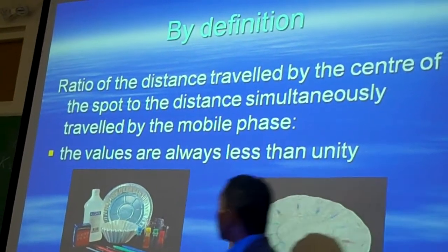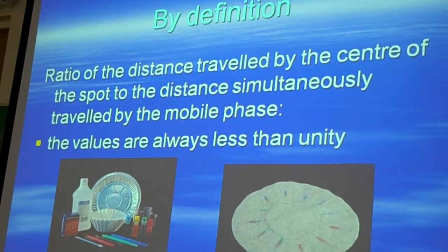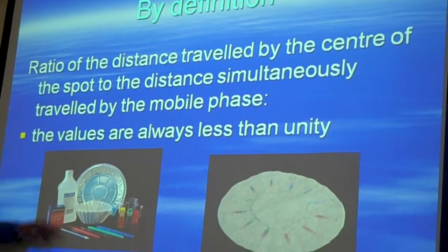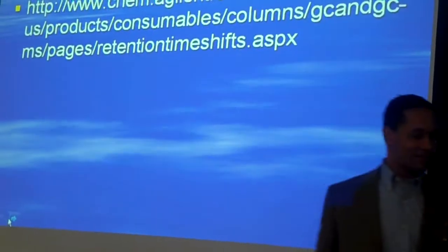And this is the middle school experiment. We did this before, probably forgot. Okay. Remember? No? All right, this is what you do in middle school. This is your mobile phase, and you separate them. And this is the video I saw.